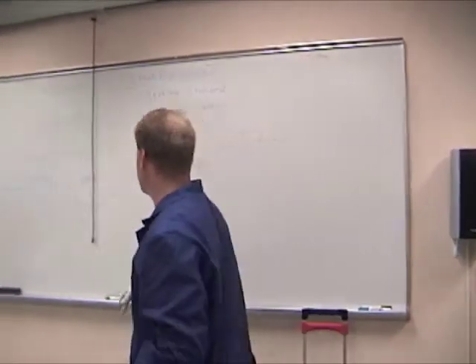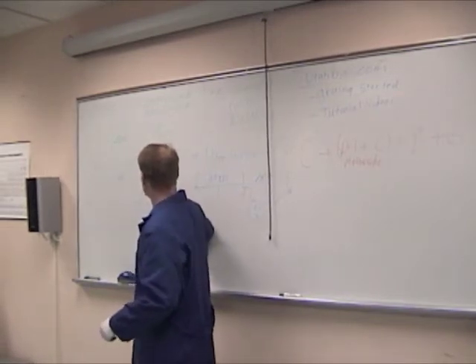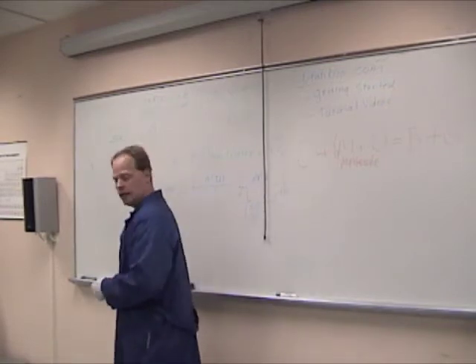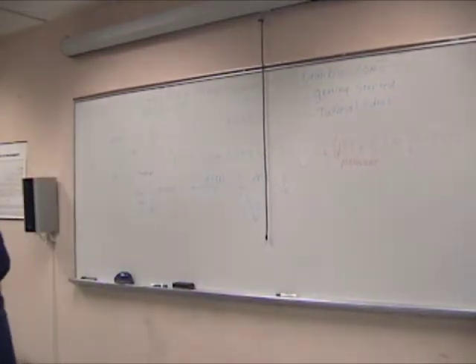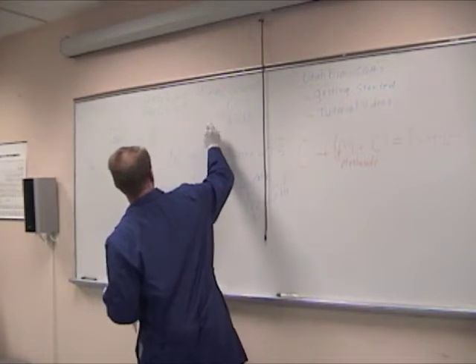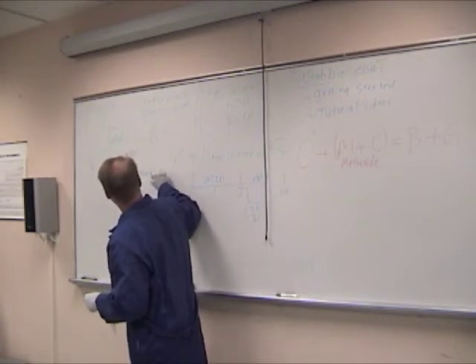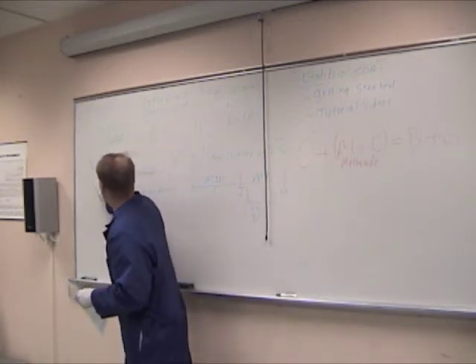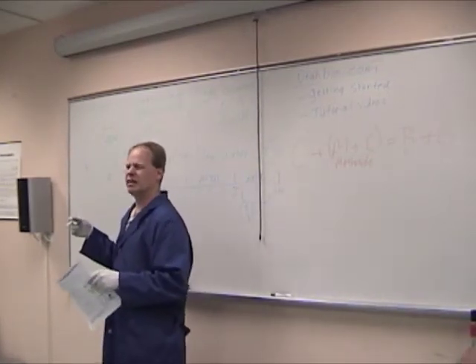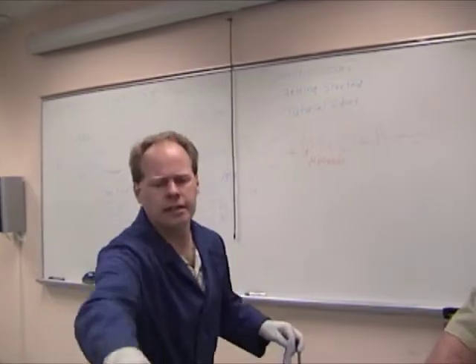To do a titration, we said we had 2 to 3 drops of phenol, some oil, and some isopropyl. The isopropyl is just acting as a solvent. Put it together. Our next step is to do the actual titration itself. You're going to add measured amounts of this stuff, which is your titration solution, to this mixture. So I'm going to add all of this in here, and then drop by drop, I'm going to add some of this basic stuff in here until this turns pink, or a yellowish color if you use turmeric. It's basically until it indicates. And this is what it looks like when it indicates.